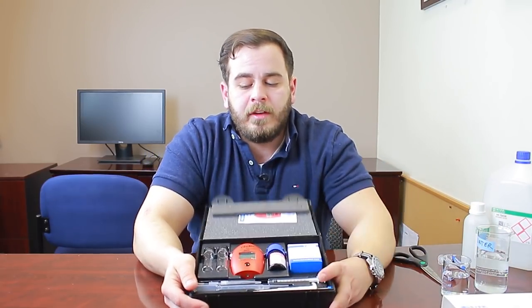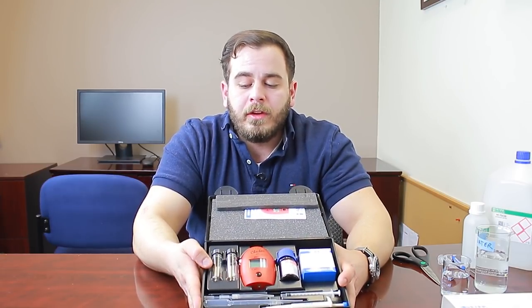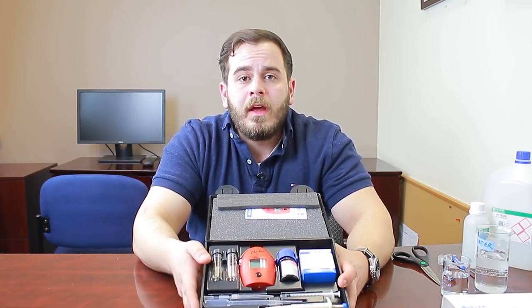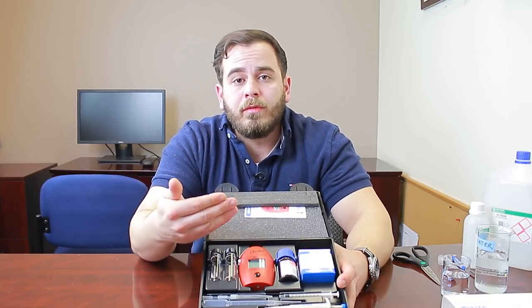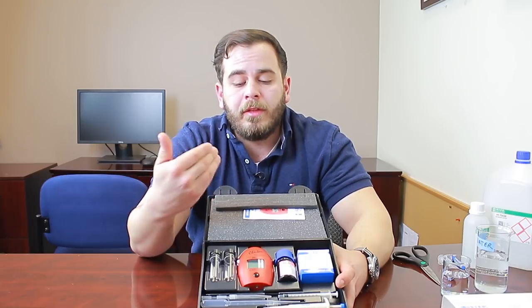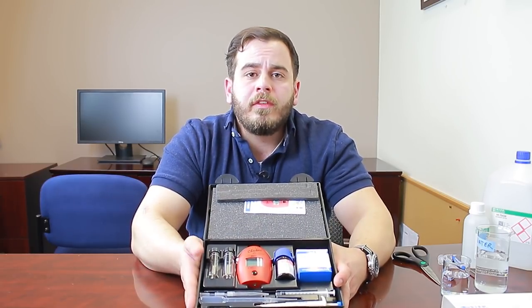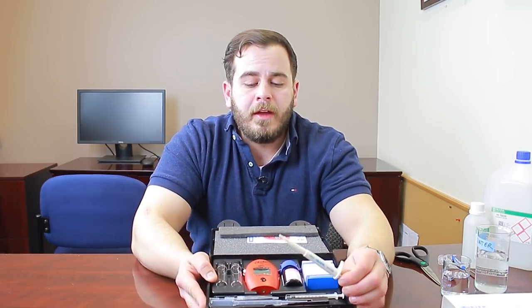This calcium checker comes with everything you need to start testing. You get enough reagents for 25 tests, two glass cuvettes — these are glass vials you fill with your water sample so light can pass through them to determine absorbance for you rather than relying on your eyes. We also now include a new mechanical pipette.